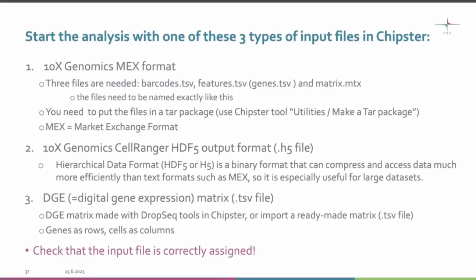The very beginning of any data analysis — getting the input data in the right format — is often the trickiest and most time-consuming part of the analysis. In Chipster, we try to make it as easy as possible, but please pay close attention to the data format.